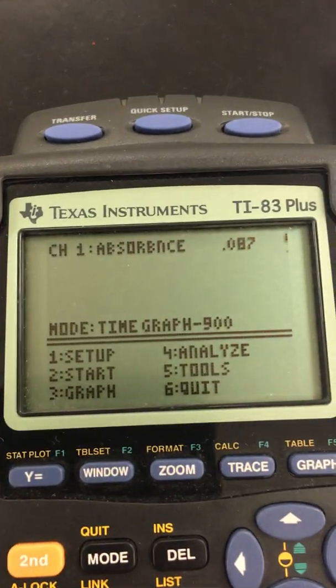All right, going to remove the 60. And we're going to do the 80 parts per million, put it into the colorimeter, and we're going to let it read. And then we're going to read the number as 0.087. Write it down. All right, and then we're going to do 100. So that's this one here.